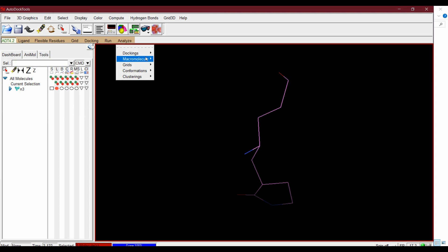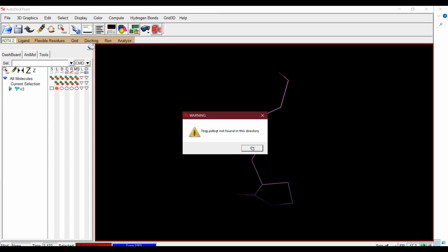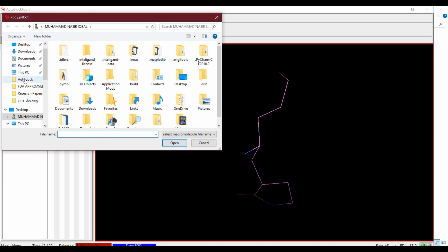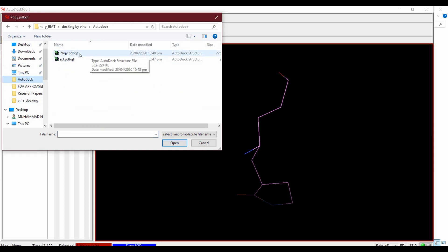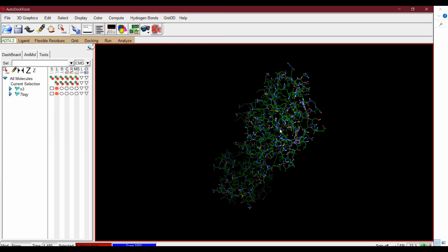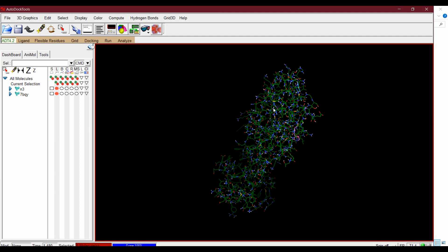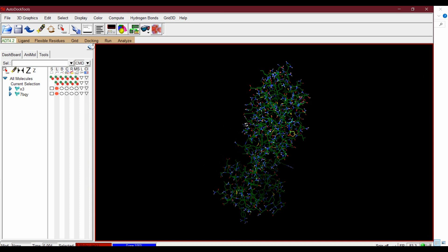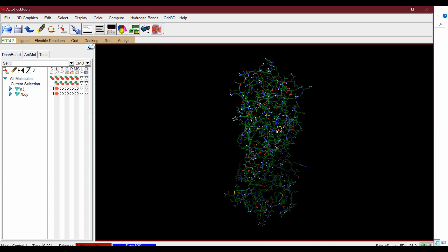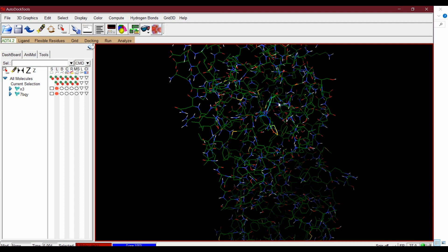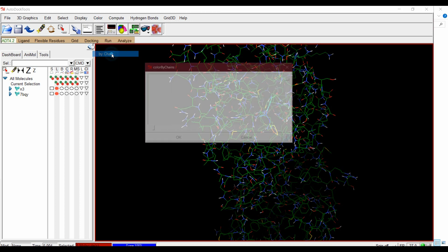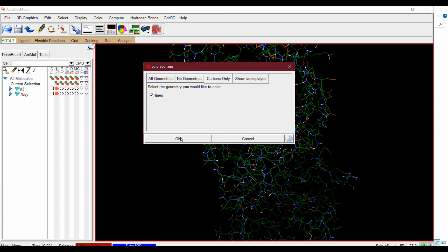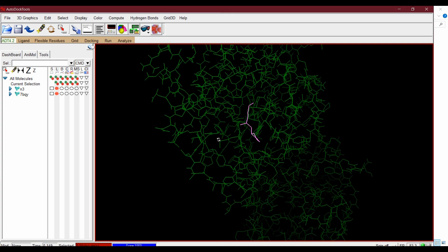From Analyze > Macromolecules, open the protein file. There is our protein. We can change the color of the ligand — from Color > By Chain, press OK and take a better look.